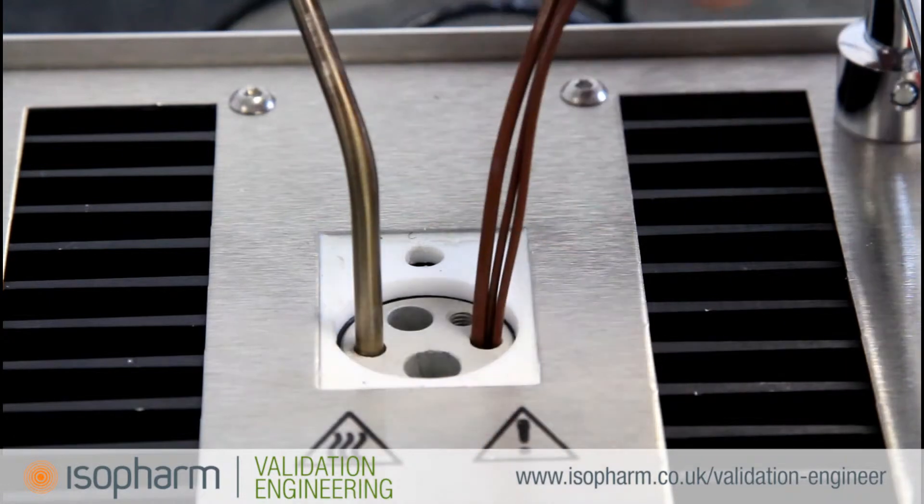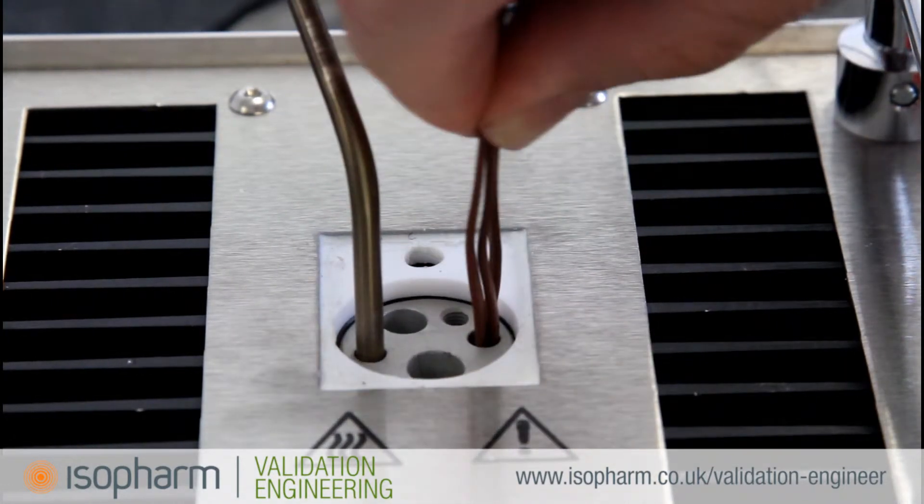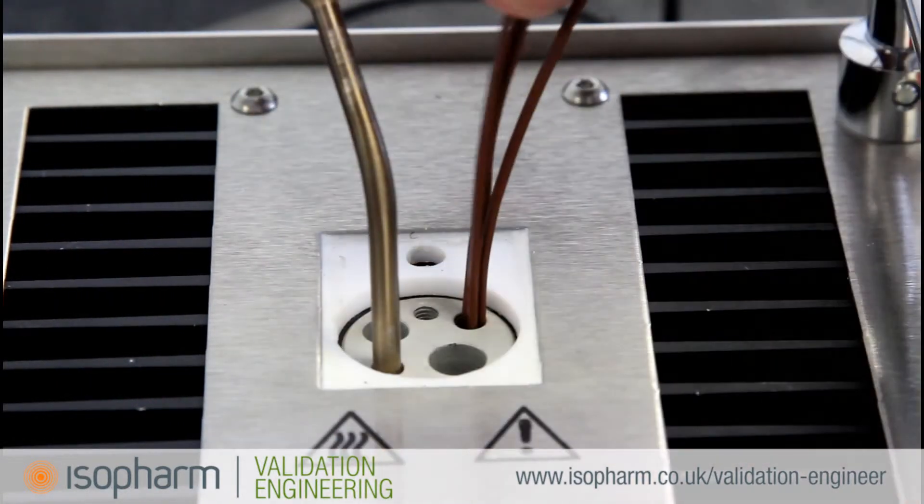If any thermocouples are positioned higher than the rest, calibration of that probe will be inaccurate. For more information on stem conduction and thermocouple theory, please see the technical section of the Isopharm website.